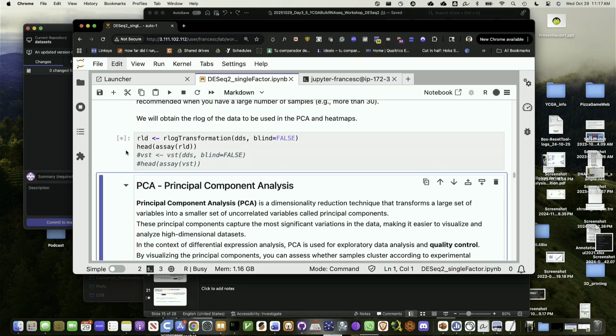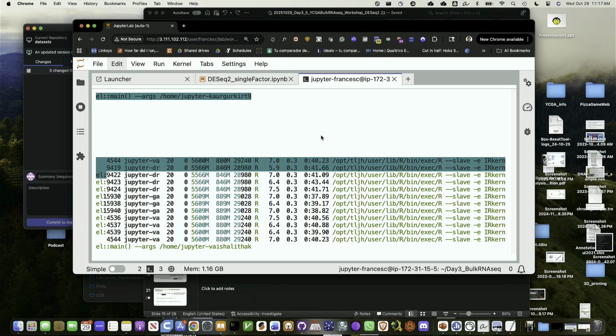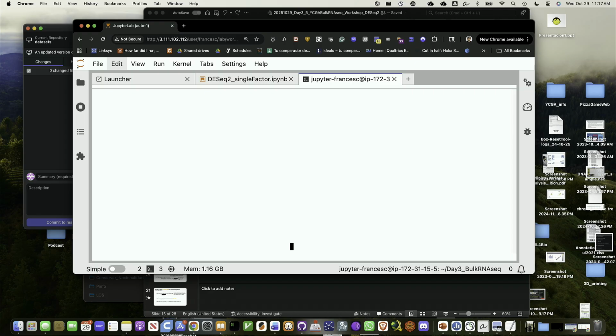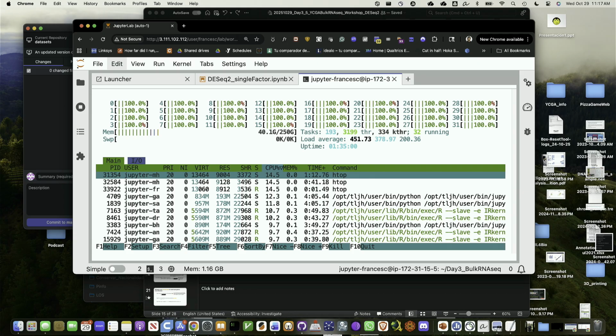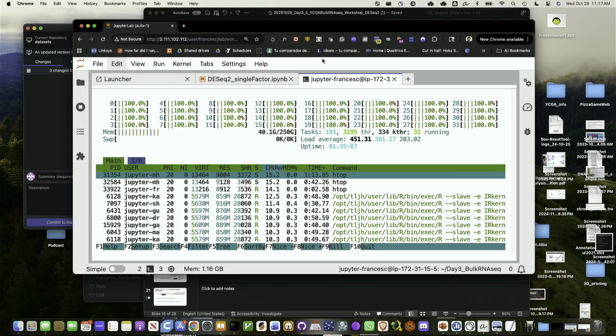I mean, we have data, we captured it, we just put everything there without any change. But why do we need to transform that? The large, big numbers count. So we are giving a smaller number by log transforming, compressing, and we bring in more uniformity. More clear visualization, or better comparison.